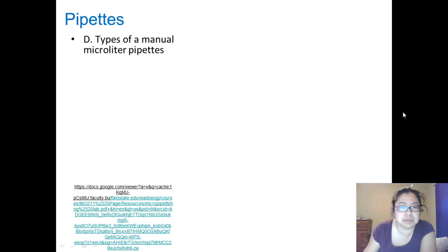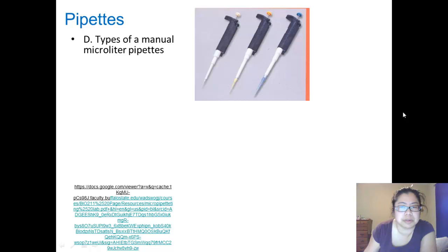There are types of microliter pipettes. You have the P20, which ranges from 2 to 20 microliters. The P200 ranges from 20 to 200 microliters. And the P1000 ranges from 200 to 1000 microliters.